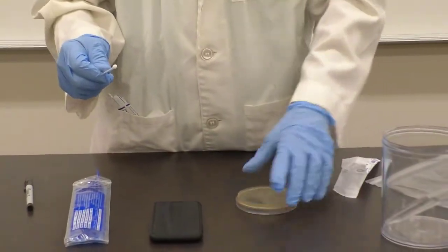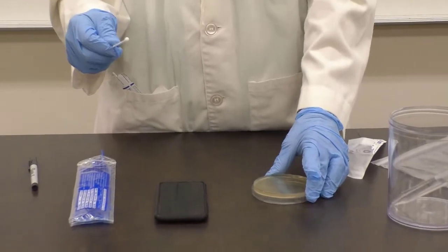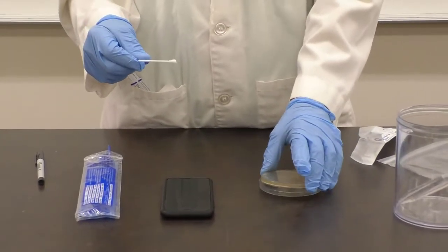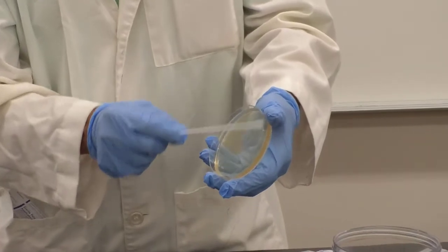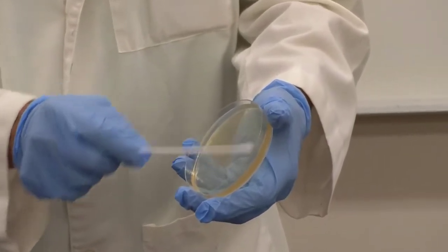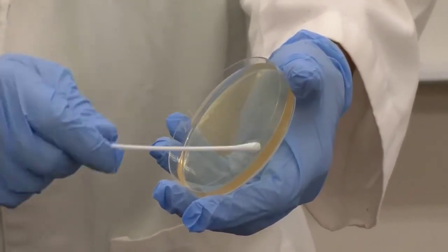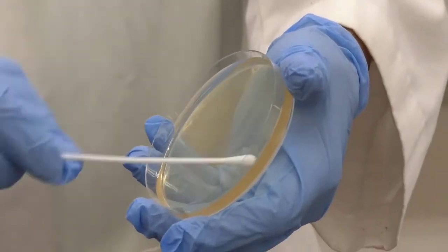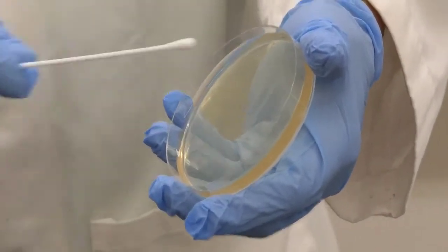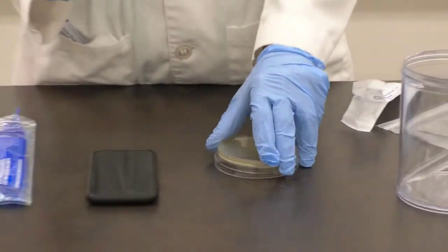Here's our set of tryptic soy agar plates. I'm going to make my initial streak here in one area. Remember, we're going to make a streak plate on this. Trying to transfer as many organisms as possible. That represents our first streak.